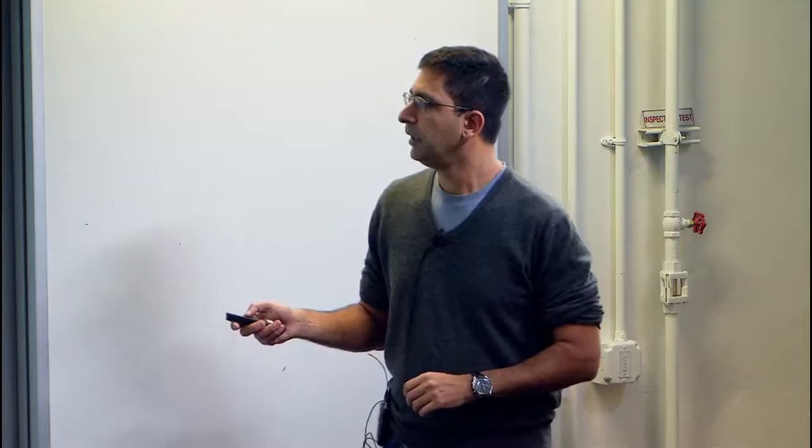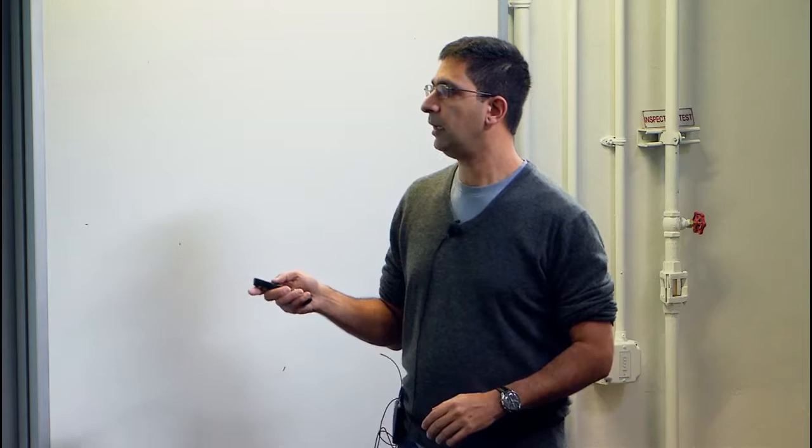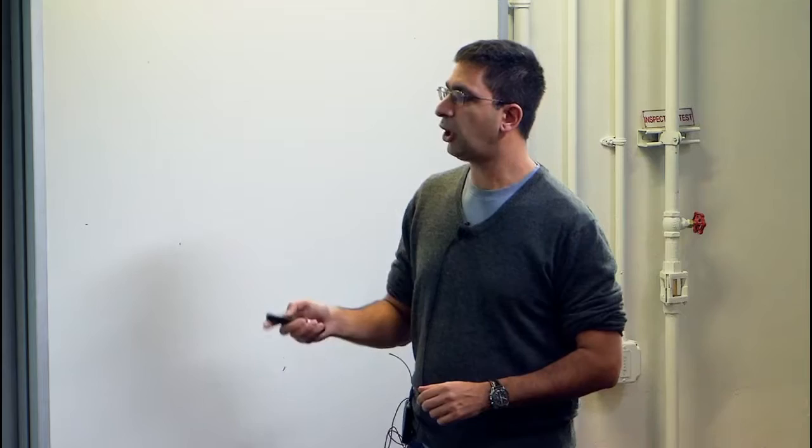And it started really moving around 2003. This is from the PhD thesis of Atif Rahman, a former student of mine. He made this plot. The size of the circles, the radius, is the read length on a log scale of that technology, and the thickness of the boundary is the error rate of the technology. And this is the year, and this is the cost. And, you know, it's going there.